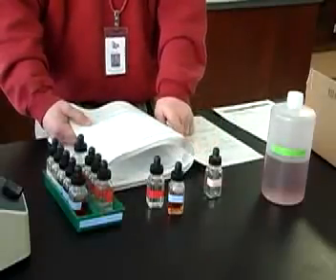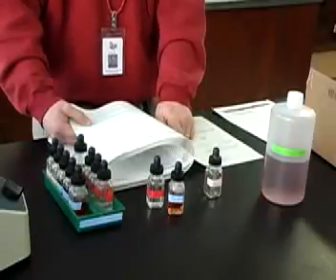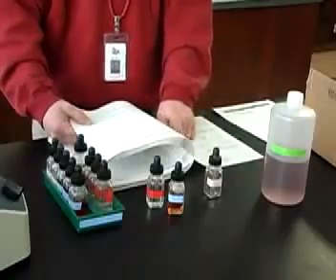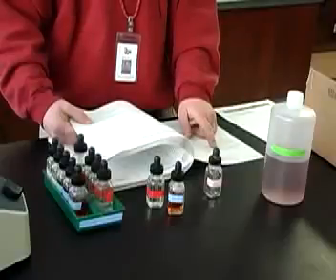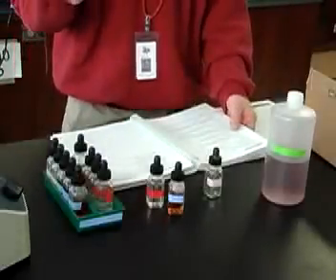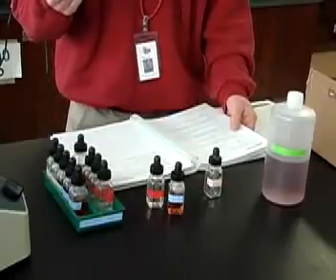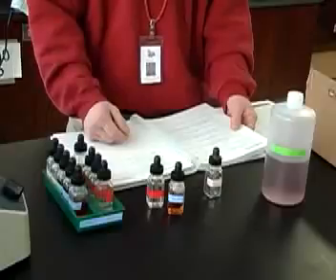Yeah, if you look to the right-hand side of your flowchart, zinc hydroxide complex, Zn(OH)4 2-, will form. So zinc would dissolve when you add that. So what must be the only thing that could have made a precipitate there? It must have been the bismuth. So ions present would be bismuth. Ions absent would be the colorful ones, manganese, cobalt, and iron. And the undetermined one must be zinc because it would have dissolved.